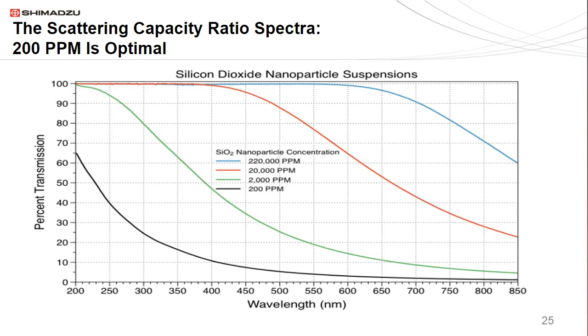Now, the reason for the shape here being increasing as it goes to shorter wavelengths is because of Rayleigh-Tyndall scatter, the small particle scattering. The intensity is a function of wavelength, with short wavelength light being scattered much more intensely than long wavelength light. And that's really the reason why the fog buster headlights that you have on your car are red. The red light, or the longer wavelength light, is not scattered by the fog nearly as much as the blue or mid-visible light would be.